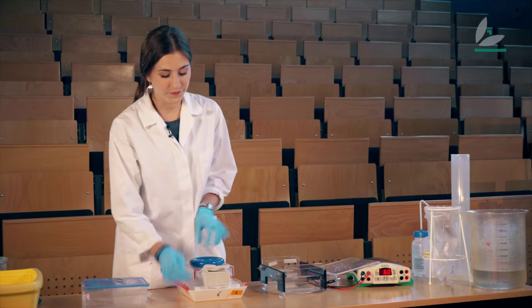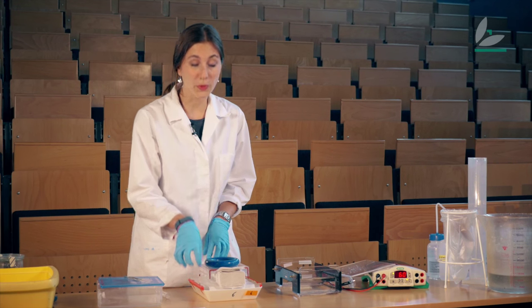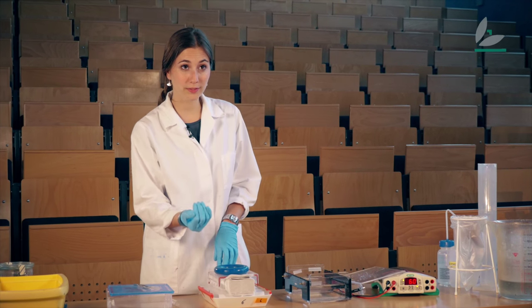In this box there's a liquid with lots of salt in it and the paper is going to soak this liquid through the gel to the foil, taking with it the DNA fragments.